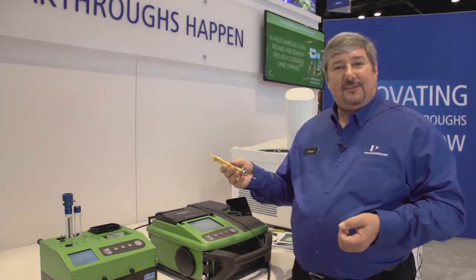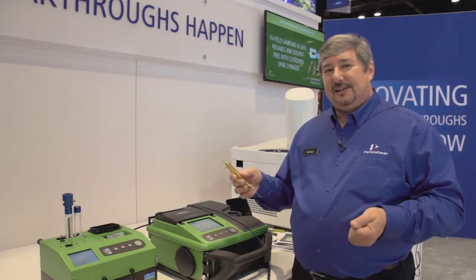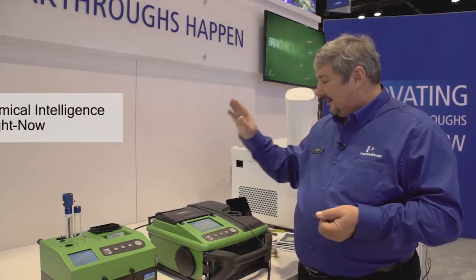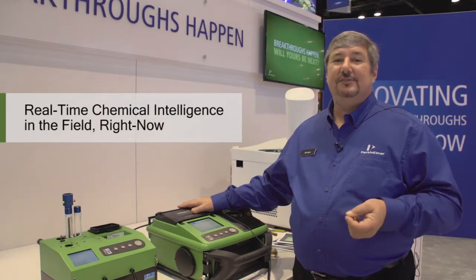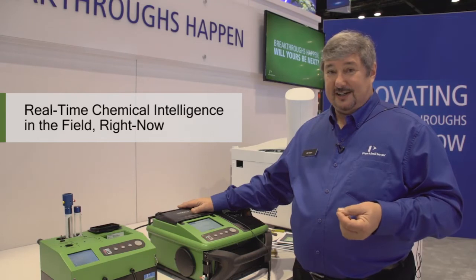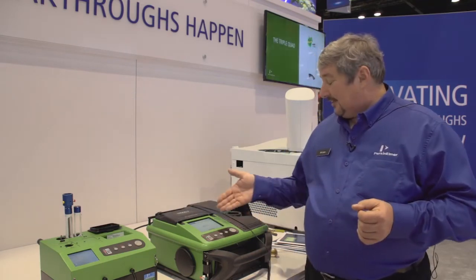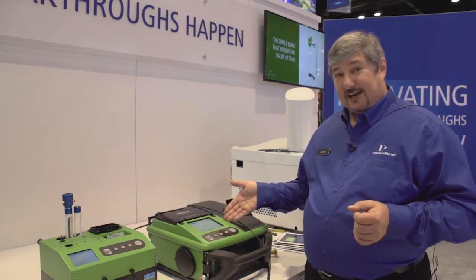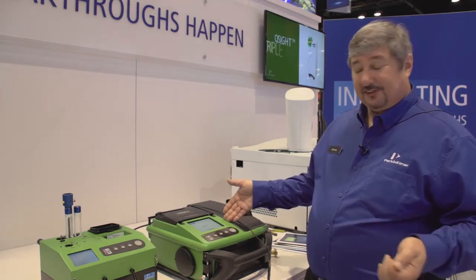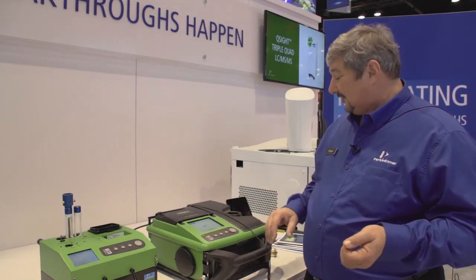With the SPME fibers, we're looking for identification — we're not looking for quantitation. This is the perfect instrument to be used in the field when you need accurate chemical intelligence right now. And so now our run is finished. That run would have taken about a half an hour on a regular conventional GC, and it's processing the results.